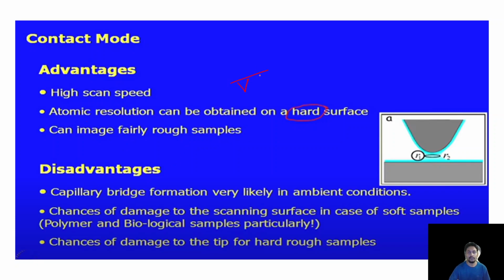But this has some disadvantages, because it is in contact with the surface. So there are chances of surface damage, and also tip damage. This is the biggest problem in contact mode, right? Also, due to the contact, there can be capillary formation by the ambient water molecules, and mainly the sample damage is also one of the things. So that is a disadvantage.